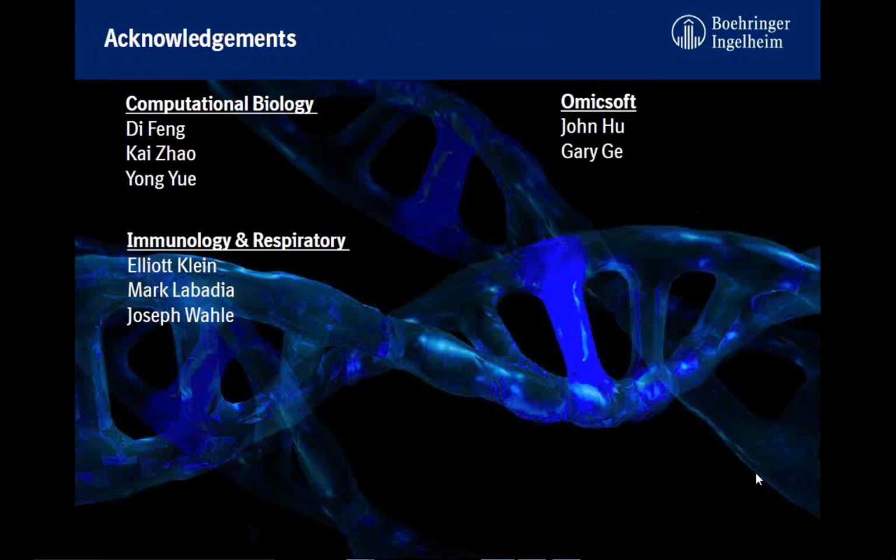But I'm very careful about using it on all data. If you work on cancer, it's great for the T cell. It depends on your experiment. If your experiment really has a lot of cell cycles and things like that, you probably will say this is a component I want to take a look at, but usually you say I want to remove this confounding effect.